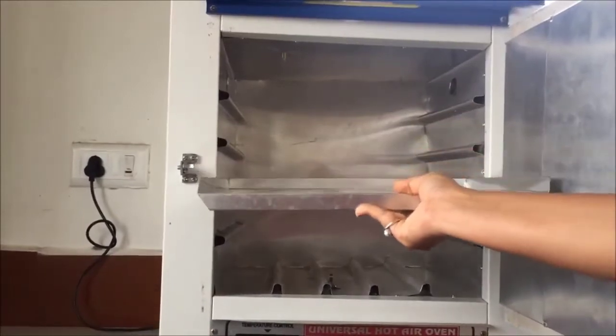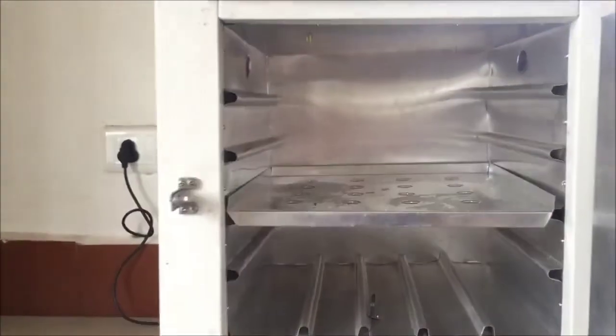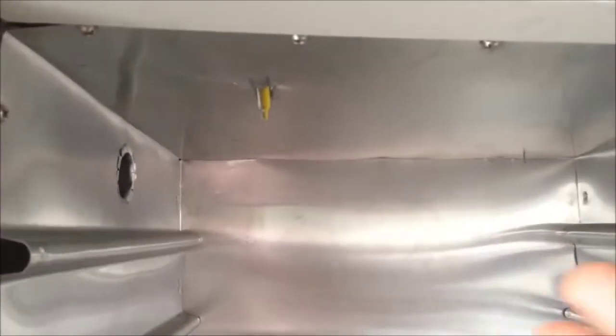For better visualization, let's move the tray from the upper side down. Now let's see what components are above the hot air oven. As you can see, there is a yellow tip — that is the tip of the thermometer we already saw — which indicates the exact temperature inside the hot air oven. There are also knobs on the left side as well as the right side.